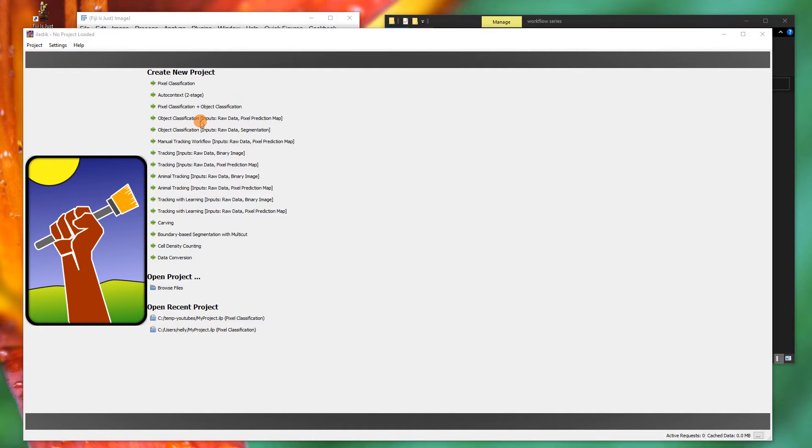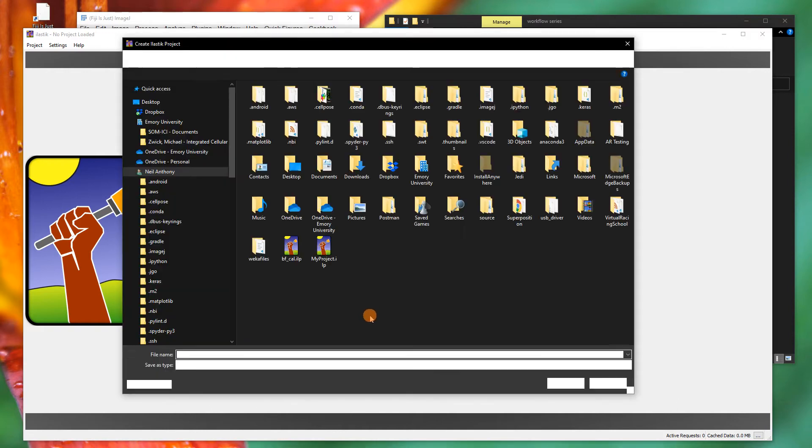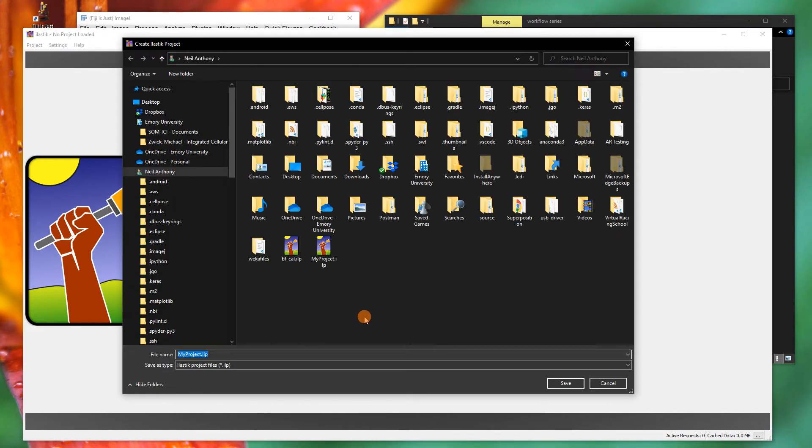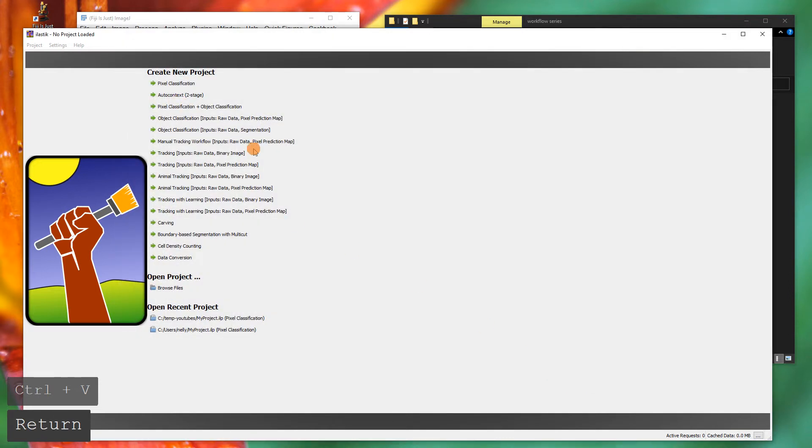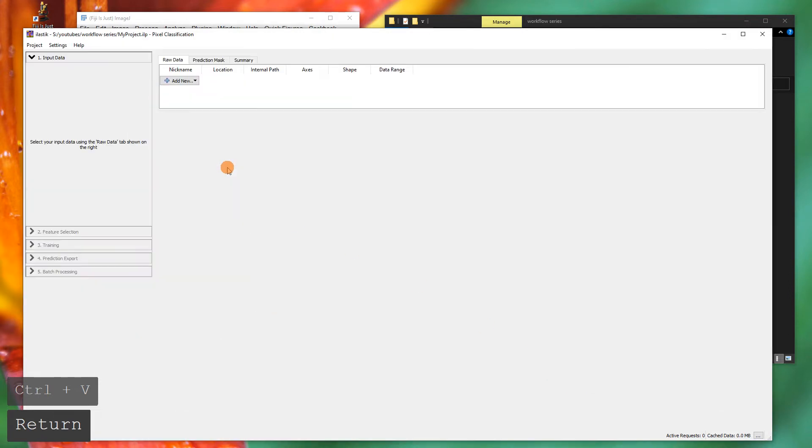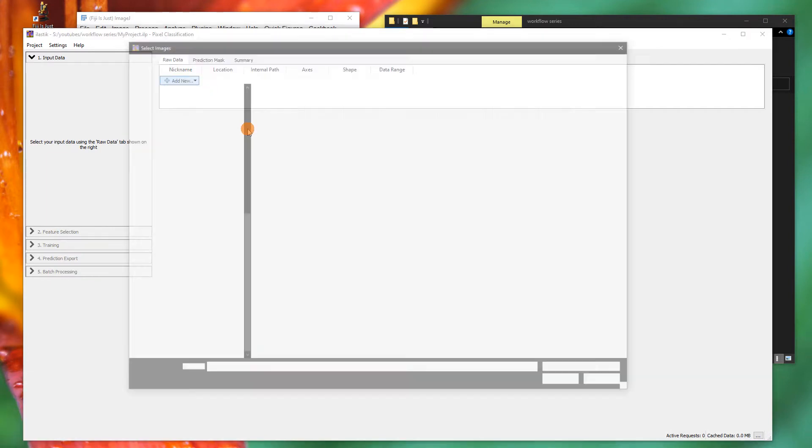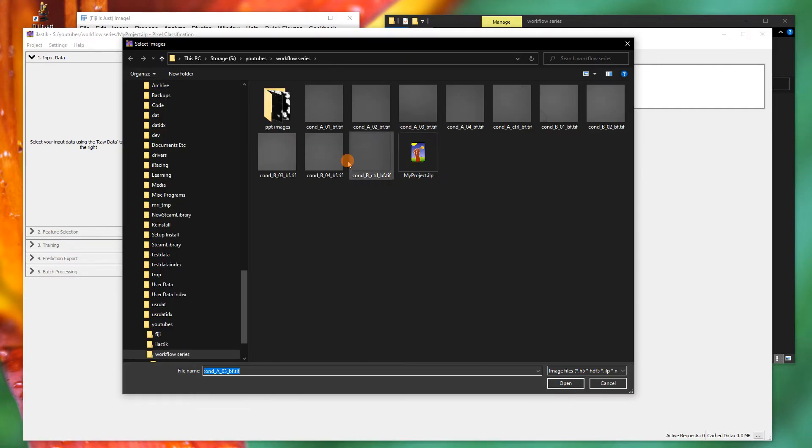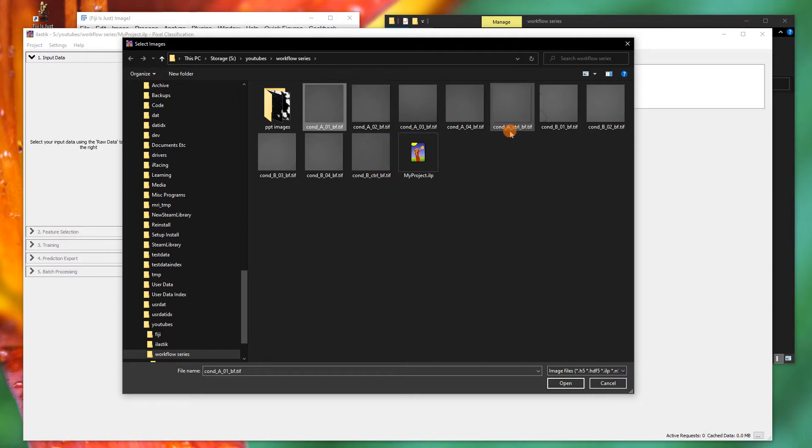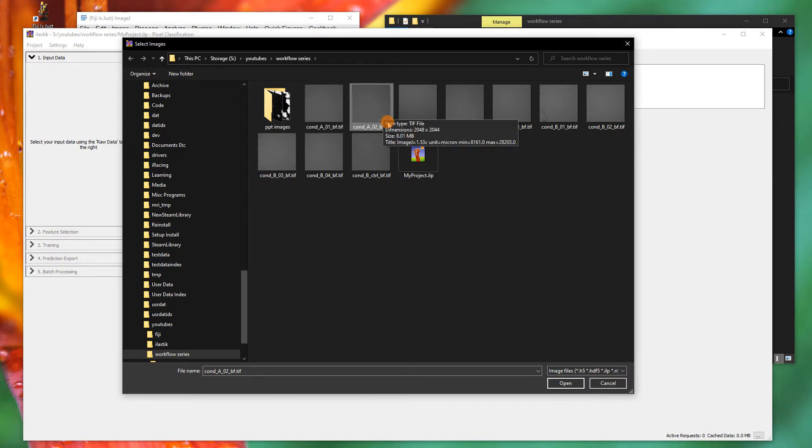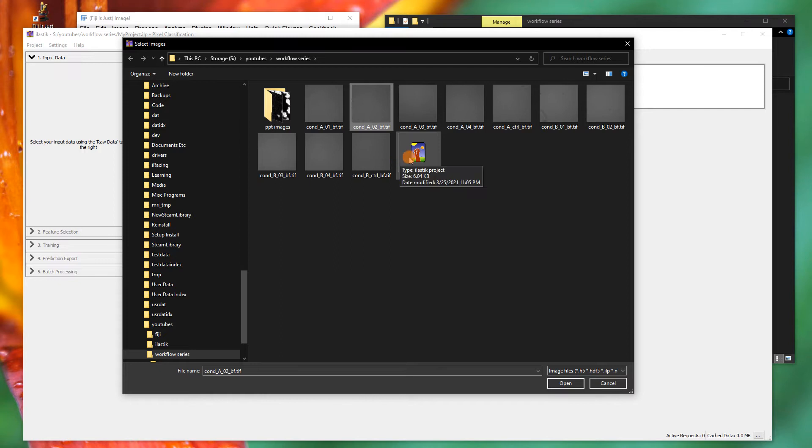We're going to create a new pixel classification and we'll put that in our folder here and just call it my project for now. Once that opens, what we have to do is pull in the data, and that's why we export it to TIFFs. We're going to add these images in here. We can use all of them and go through all of them and train them, but condition A and condition B have slightly different morphologies. The controls aren't too different, but what I might do is pull in just a few, a subset that go over the different morphologies and shapes that you might see.